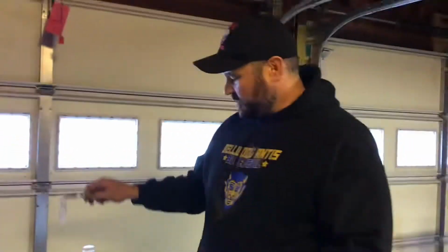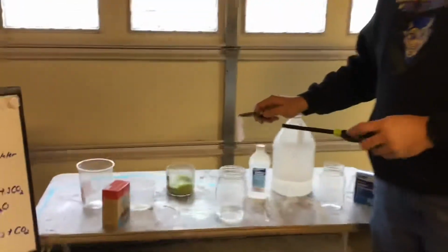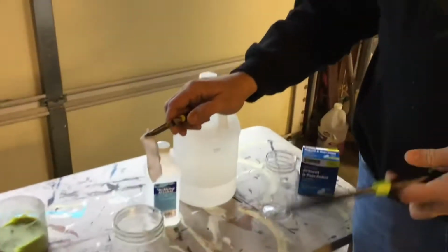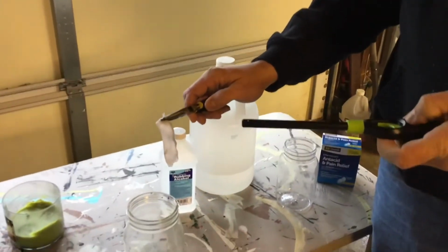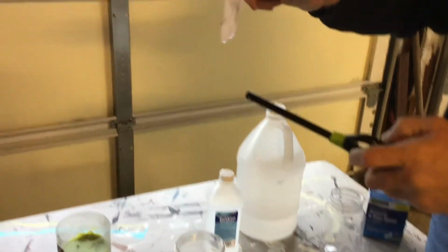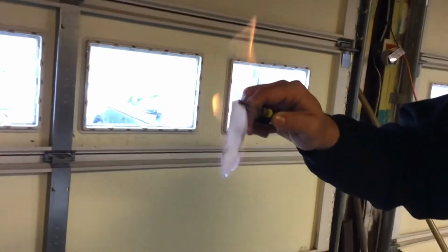So the first reaction I was going to show you, this is plain old rubbing alcohol. So I poured a little bit of this rubbing alcohol into here, and rubbing alcohol burns at a much lower temperature than what you would normally expect a lot of things to do. So when we start it, it should burn at that nice clean color, and notice how my rag's not burning.